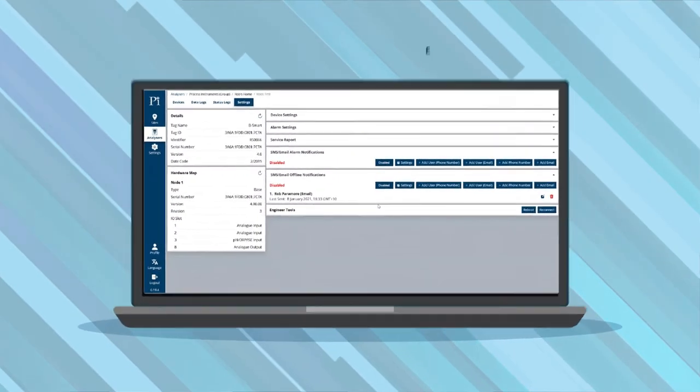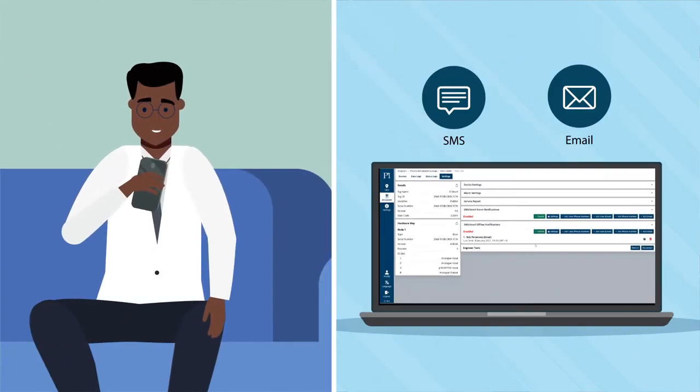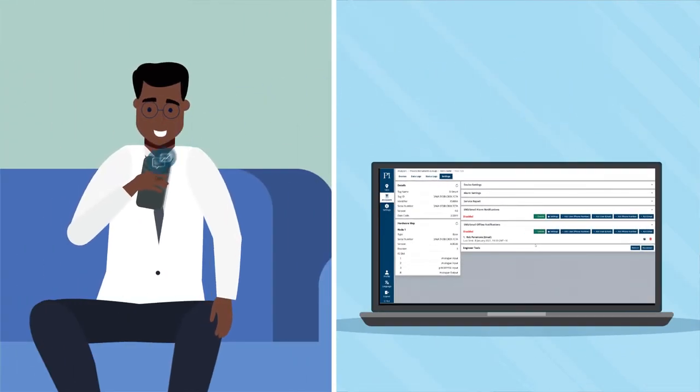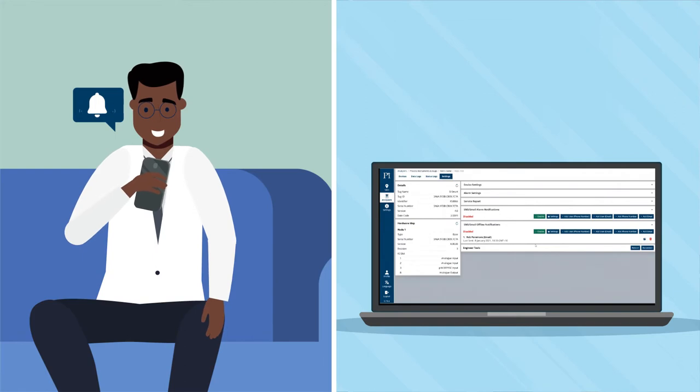Now Bob sets up email and SMS alarms to tell him if anything changes in real time with live data. If it does, he can respond on his phone from anywhere.